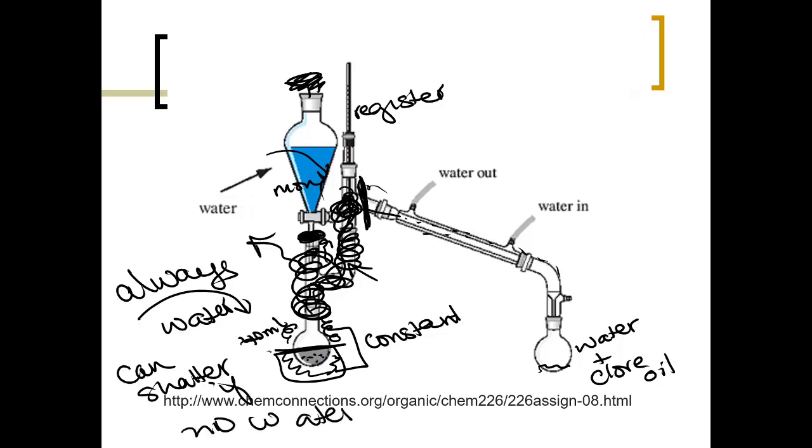And the only way that you might be able to tell that it's shattered is that you might see what looks like brown gas, or just some sort of gas coming off from your setup, and it will start smelling really bad. So never let it run out of water. There should always be a level of water.